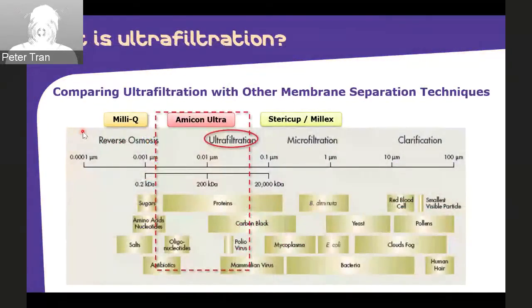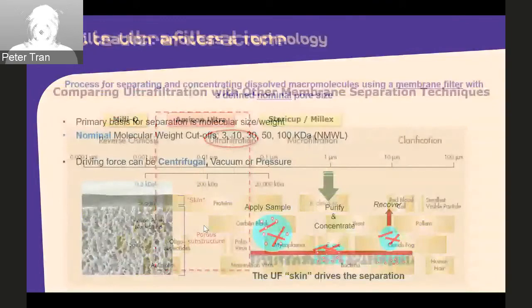Okay, let's talk about ultrafiltration. In the lab, you might use microfiltration using a syringe filter with a 0.2 or 0.45 micron pore size, just to remove bacteria, for example, or to do clarification. They call it microfiltration. Ultrafiltration has a much smaller, kilodalton pore size, so you can remove protein, nucleic acids or viruses, very small particles. And the separation is based on the size of the molecule.